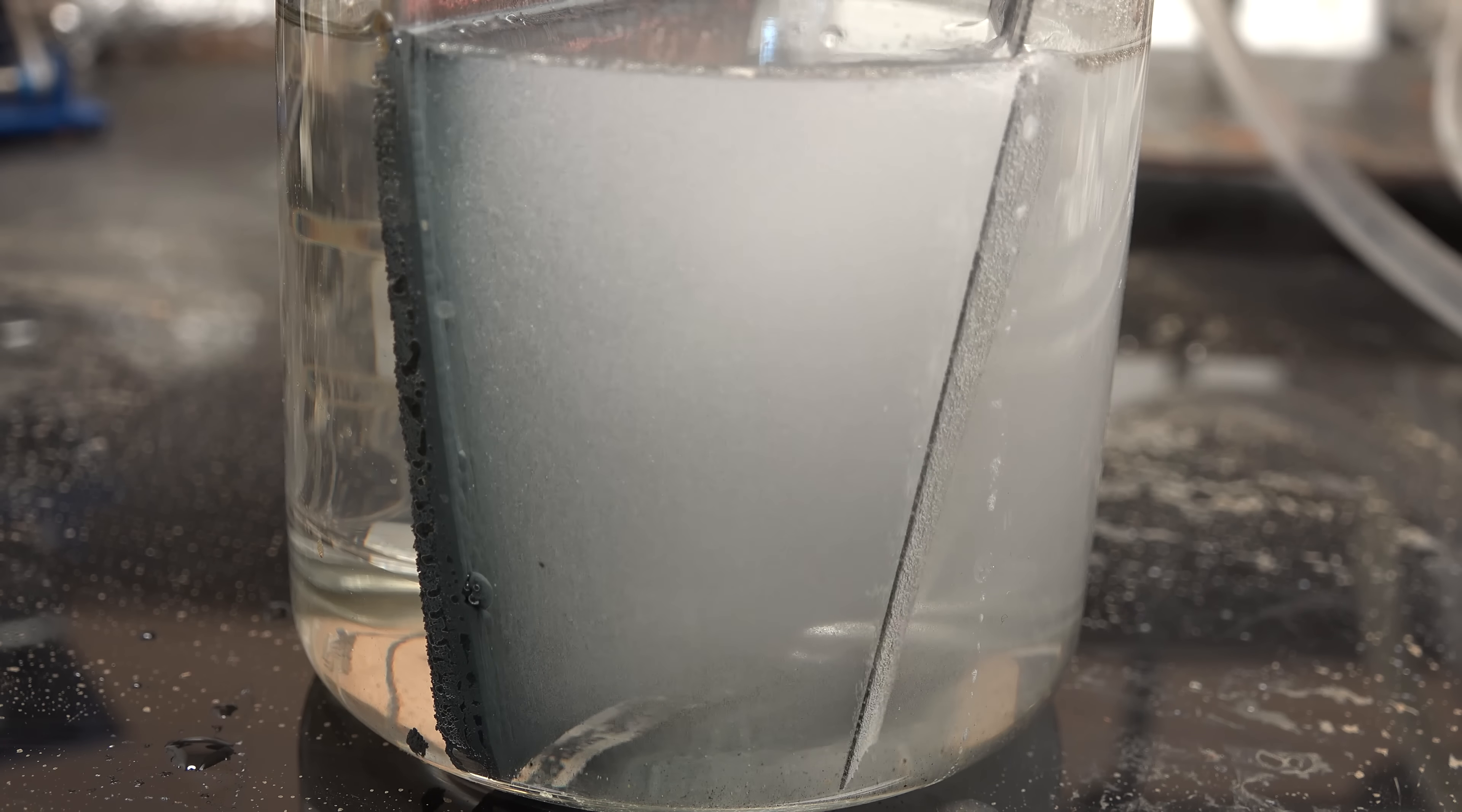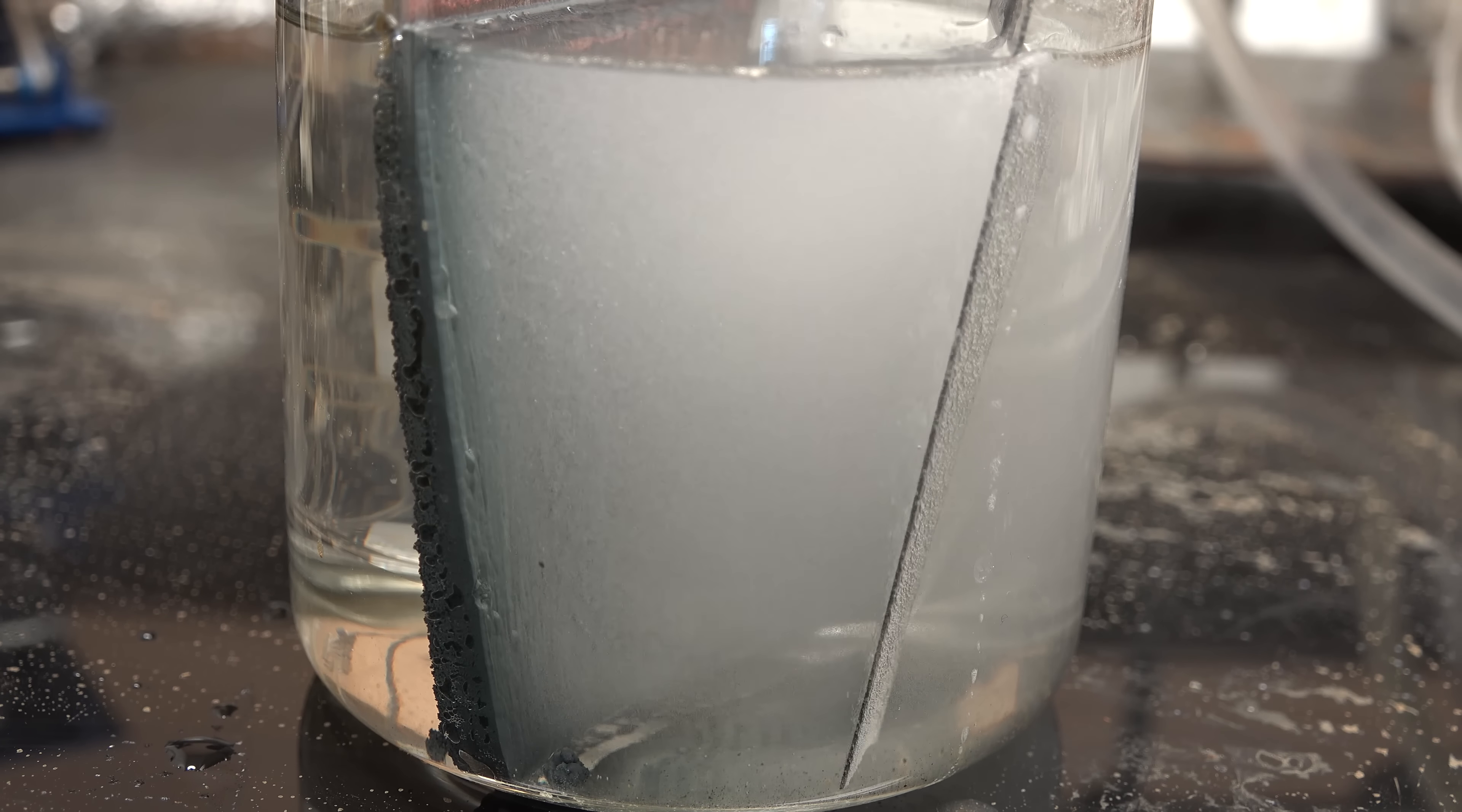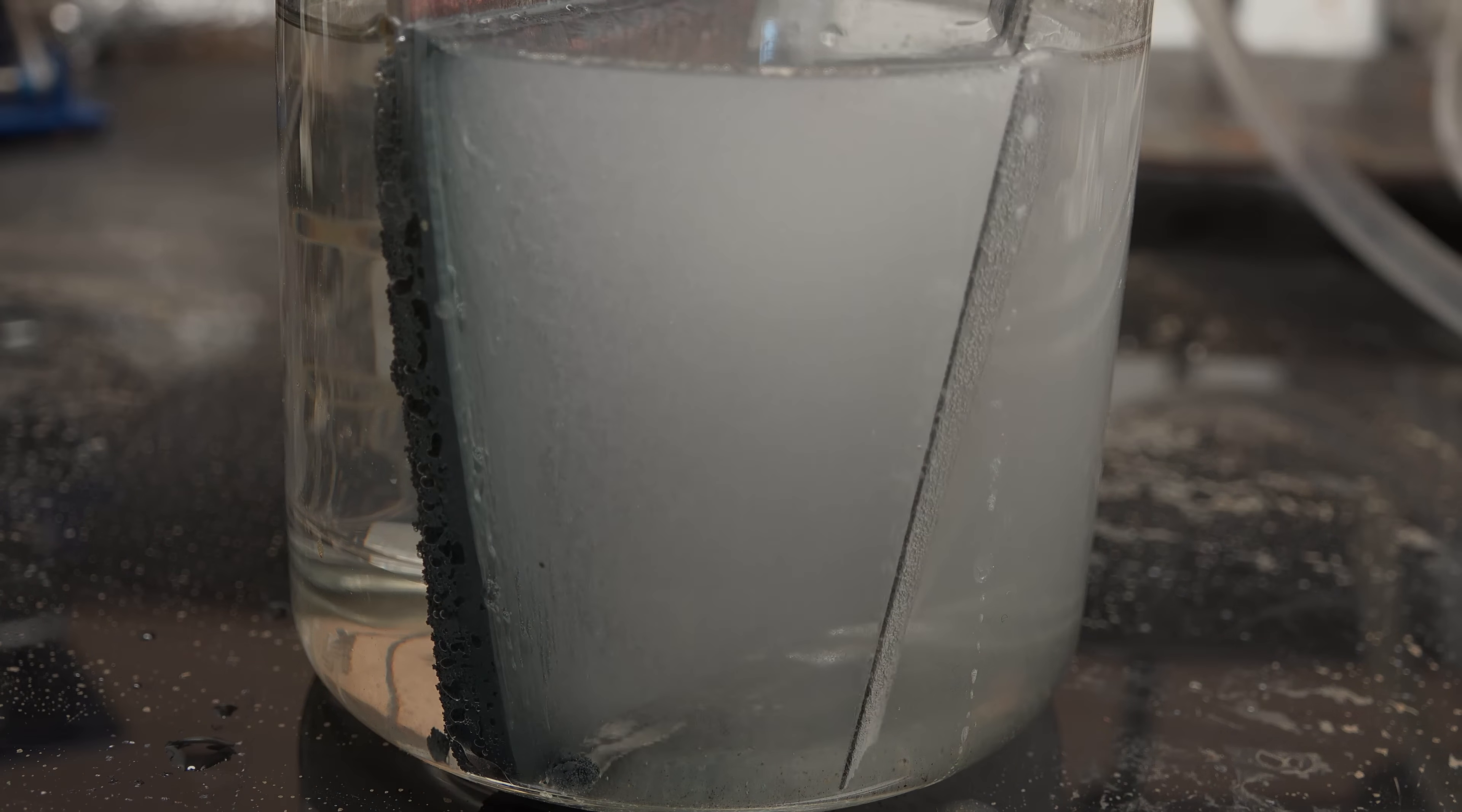Now if you look at the zinc surface you'll notice it has a somewhat sandy texture to it. The crystals of zinc metal produced in this process don't bond very strongly so rather than a metal plate we're getting more of a metal sponge that will crumble when we recover it. Anyway I'm going to let this go overnight.